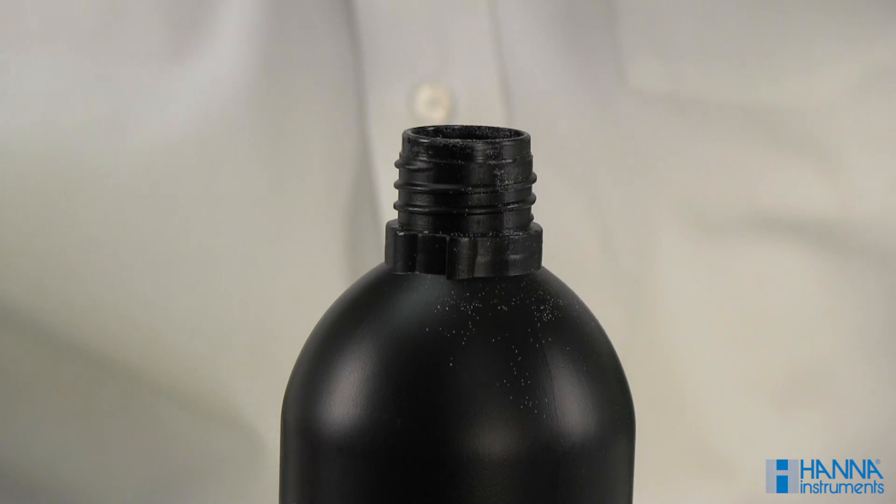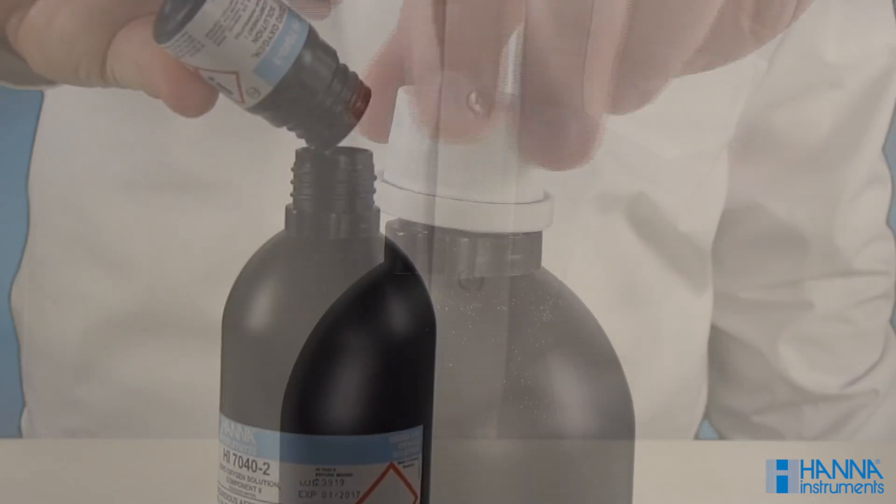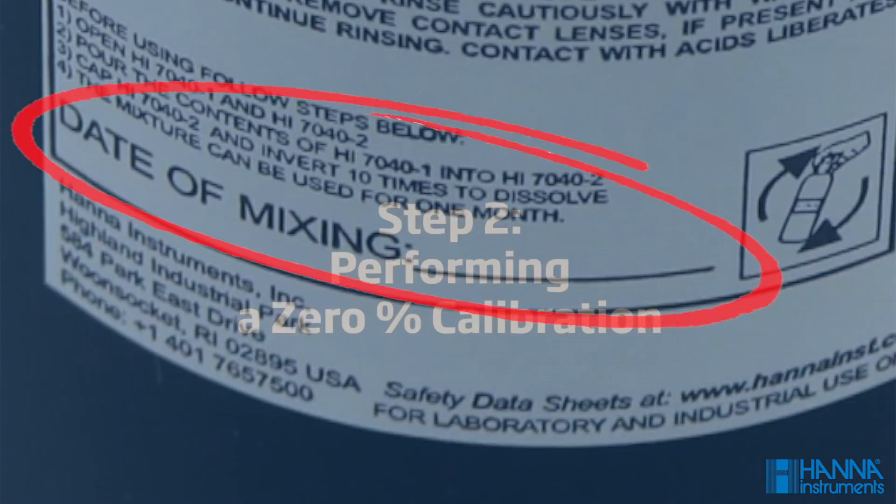Open both components and pour the contents of component 1 into component 2. Cap component 2 and invert 10 times to dissolve. Be sure to indicate the date of mixing. Now you can proceed to step 2.